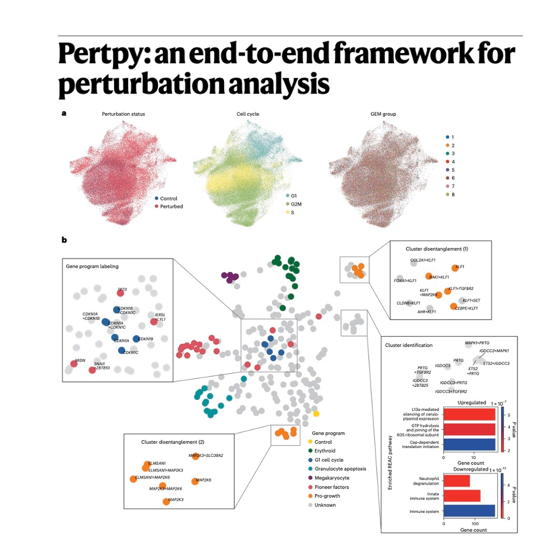So it revealed 2 completely distinct biological mechanisms for driving growth that had previously just been lumped together. That's impressive. Okay, case study 2. Deconvolving drug response. This tackles a really tricky problem, separating the effect of a drug that just kills cells from the more subtle changes that happen before death.